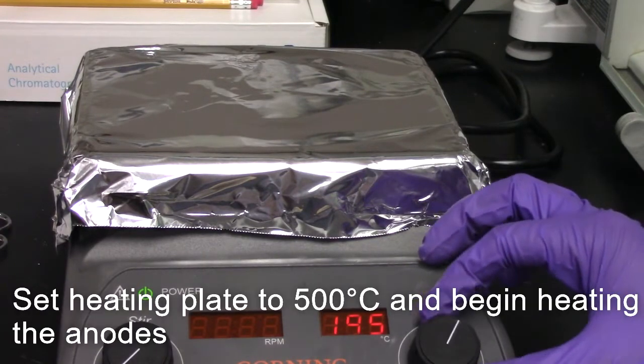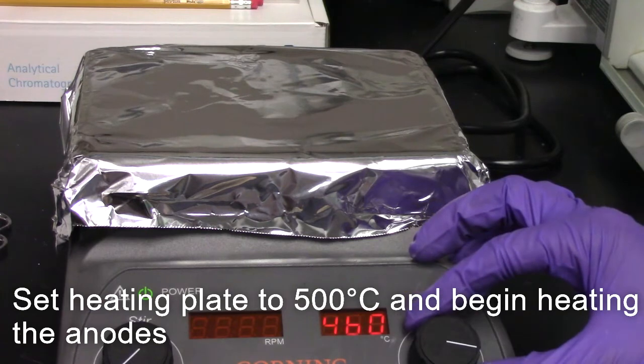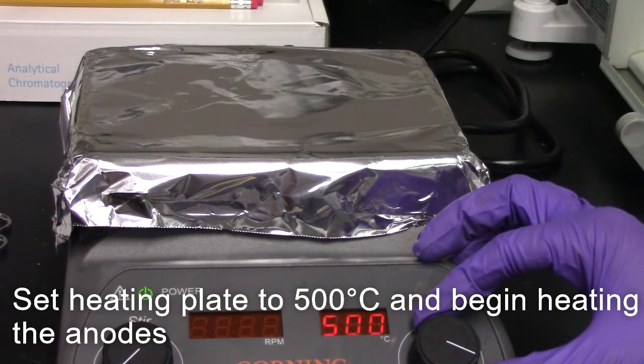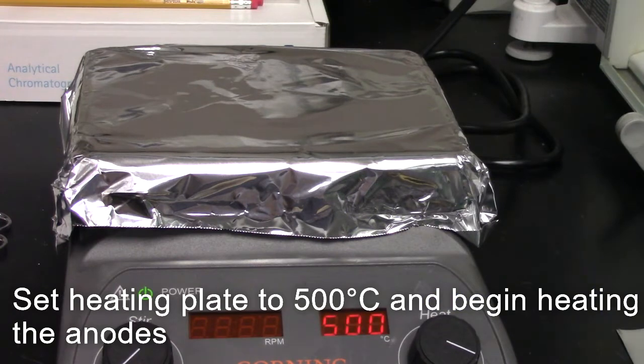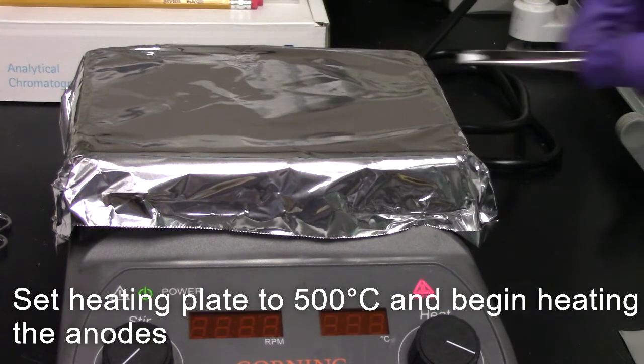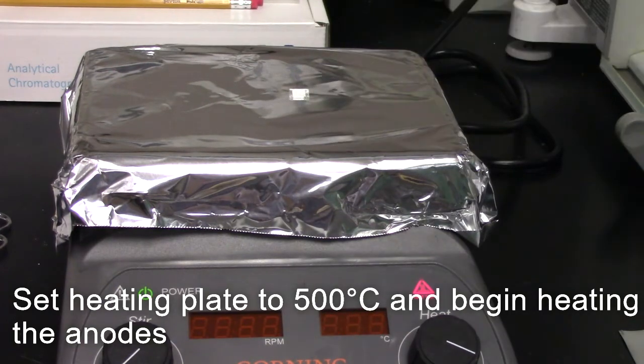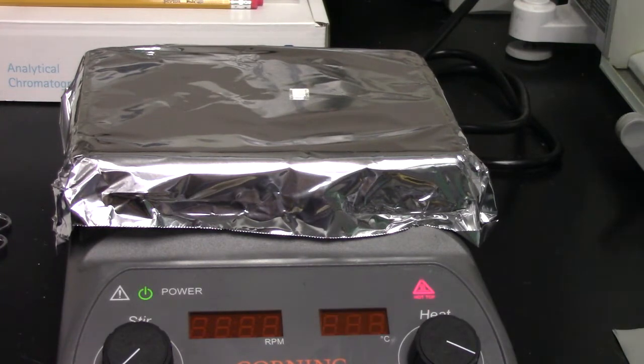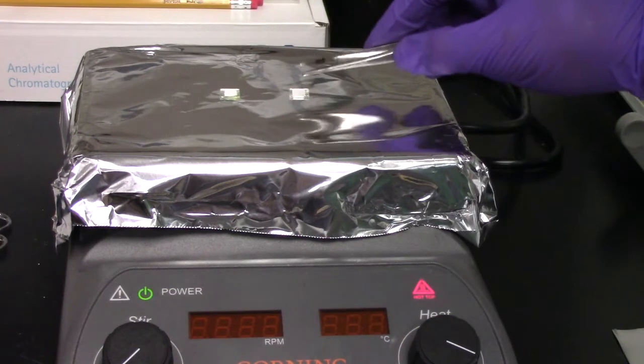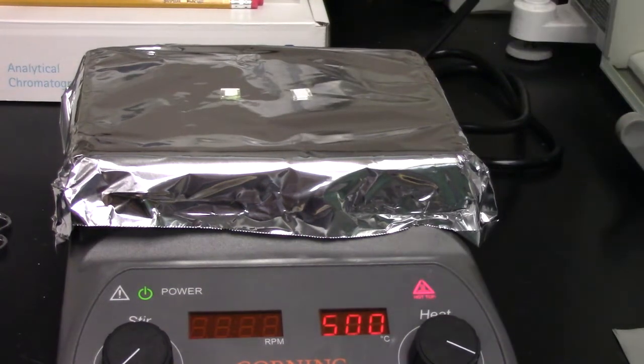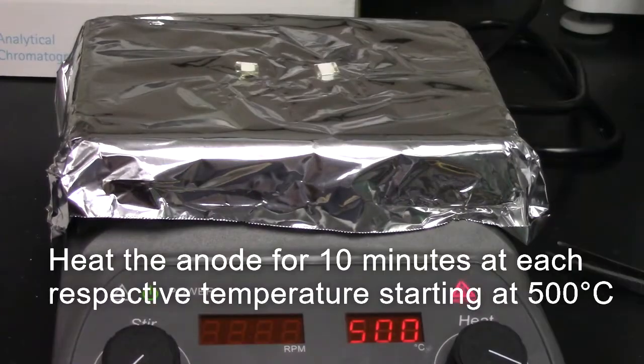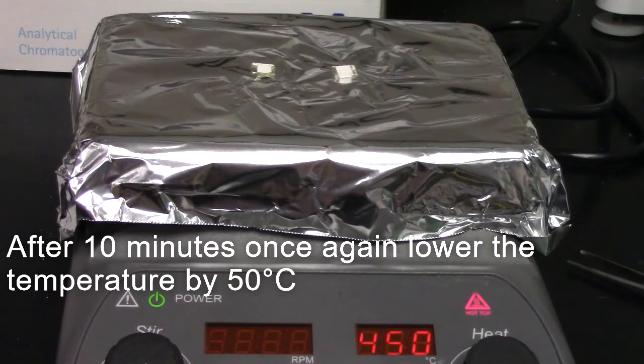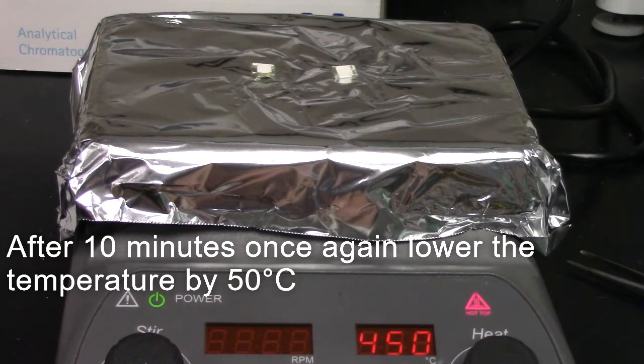Begin by setting the heating plate to 500 degrees centigrade. The anode will be heated for 10 minutes at each respective temperature.